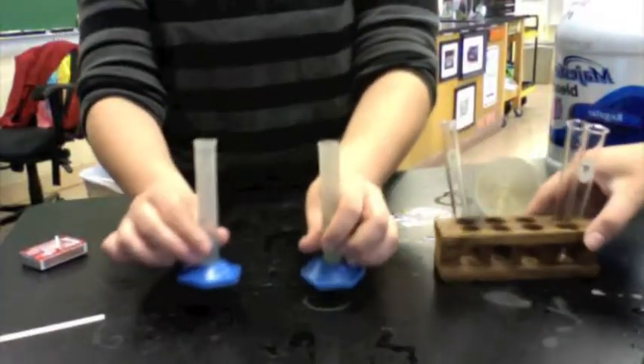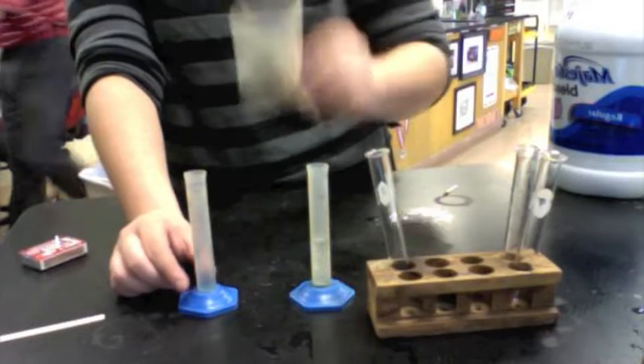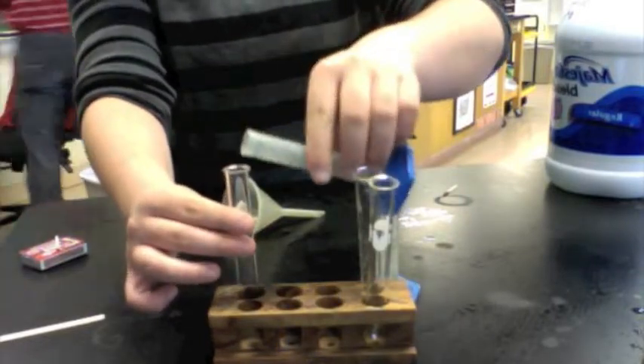Before doing the oxygen test, make sure you have bleach and hydrogen peroxide. You will use a funnel to pour these into the graduate. First, you will pour the hydrogen peroxide into the test tube.